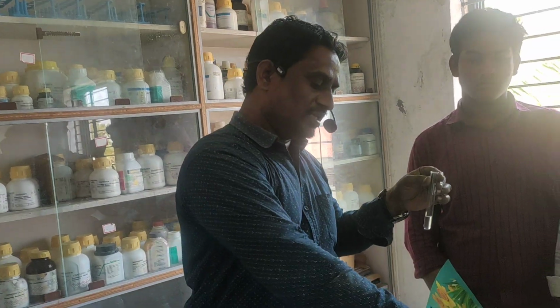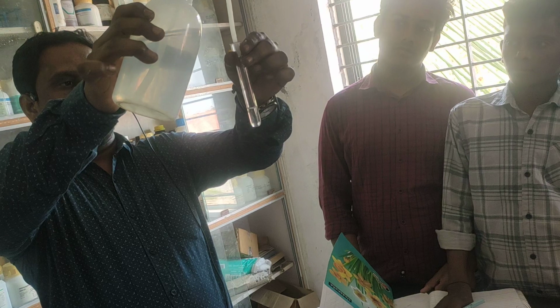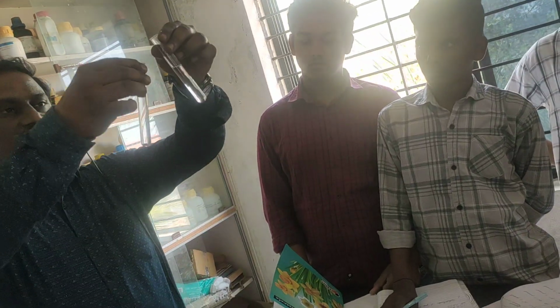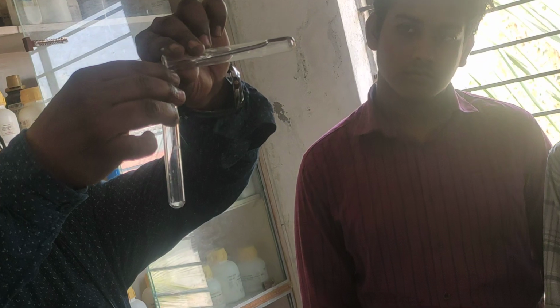Now for this original solution also you add a little bit of water, up to three-quarters of the test tube, let me add up to here. So now this is the original solution. Take some, a little bit, of the original solution in the test tube.